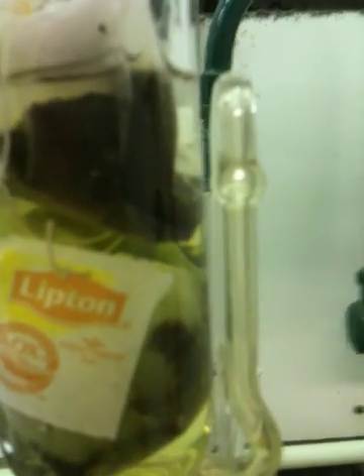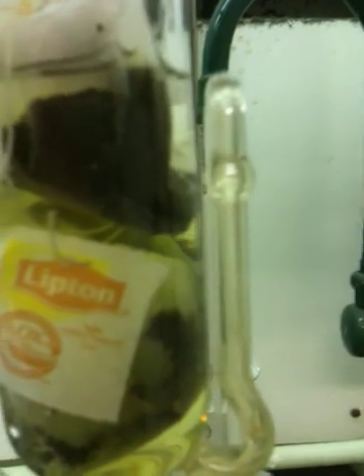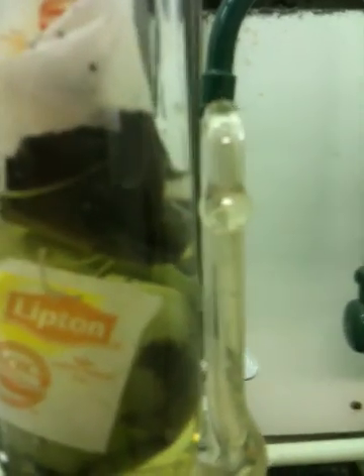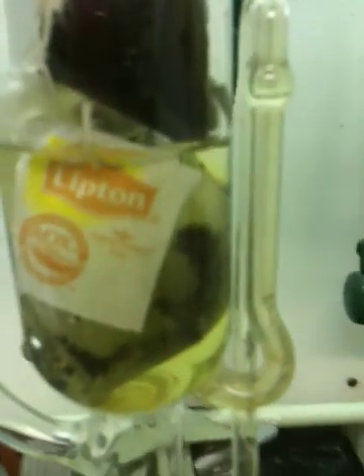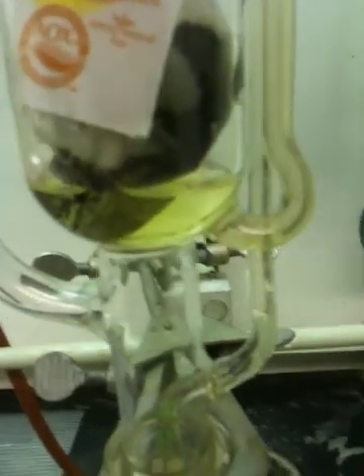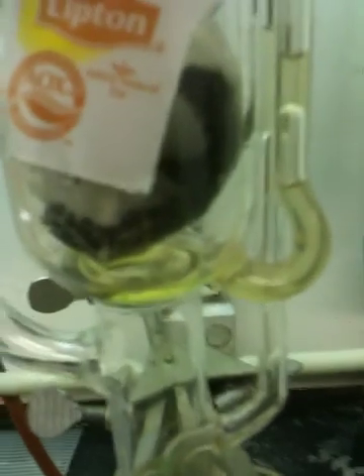It's about to tip over now. There it goes — see what it's doing? It's draining. It's like the siphon is draining all the liquid out of the pot. Now watch the siphon drain. See how it's drained? Where did all the liquid go?